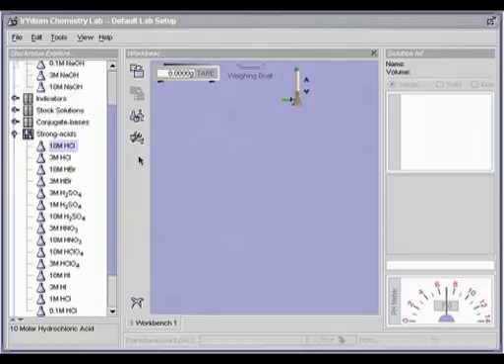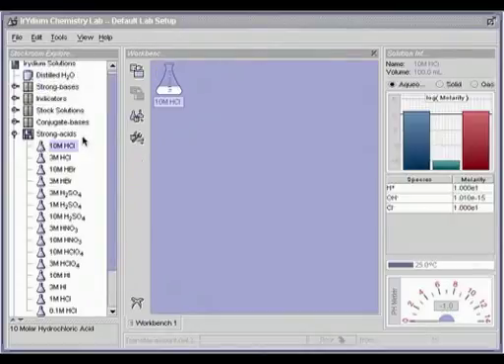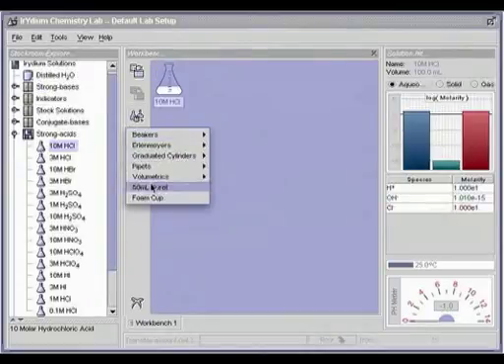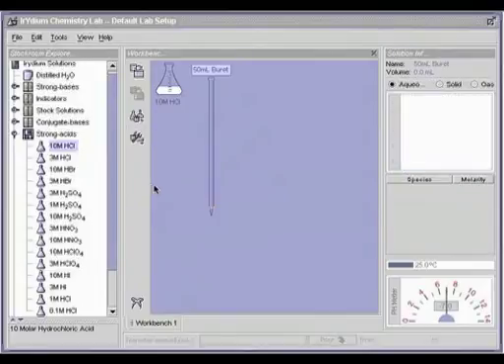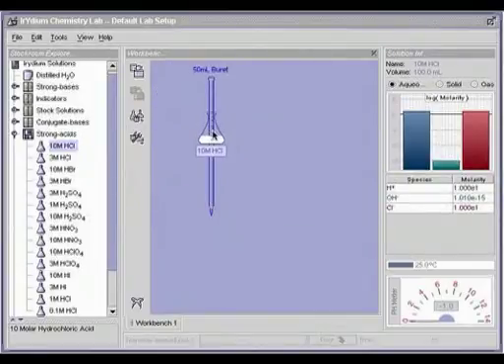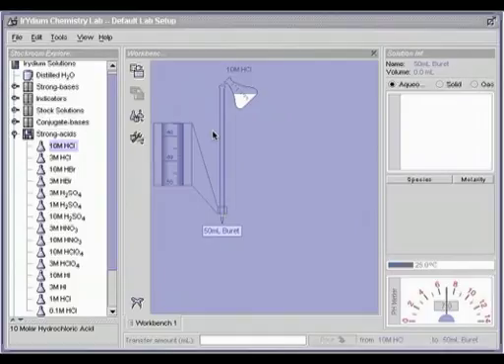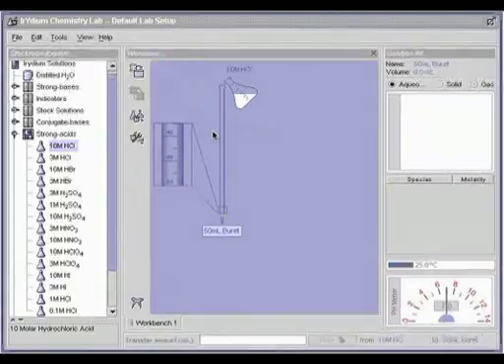A simple drag and drop transfers a solution from one piece of glassware to another. To fill a burette, drag the flask onto the burette. The transfer bar on the bottom of the window then activates and you can type the precise amount you want to transfer into the bar.